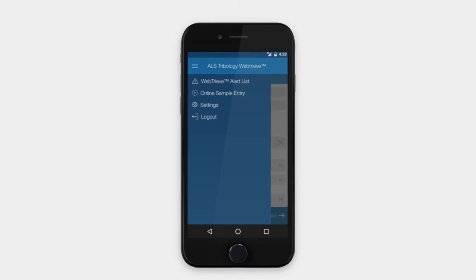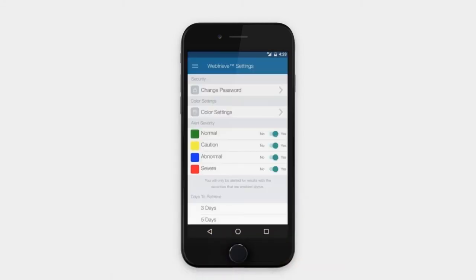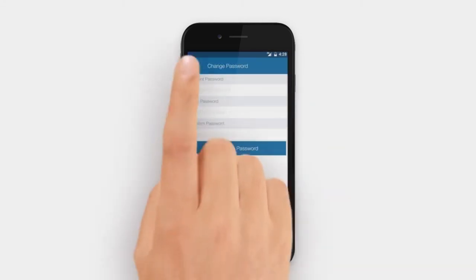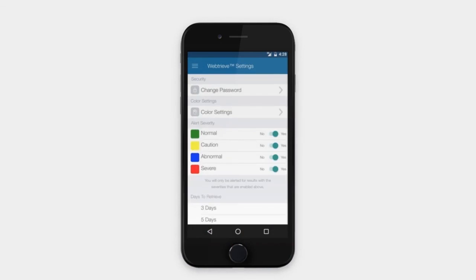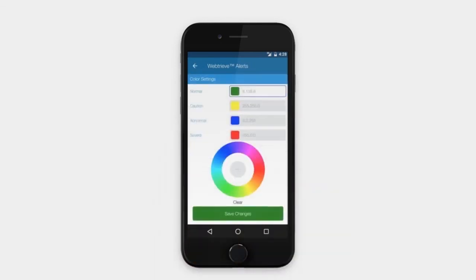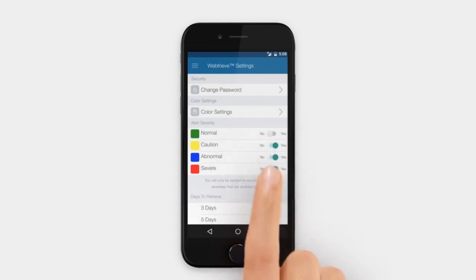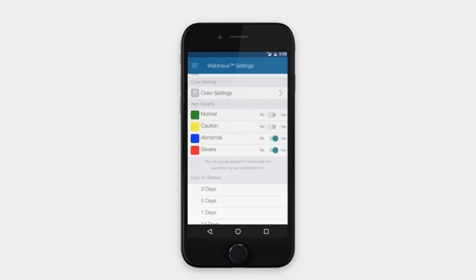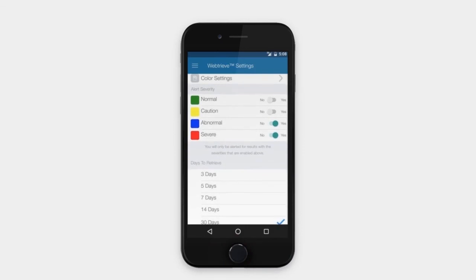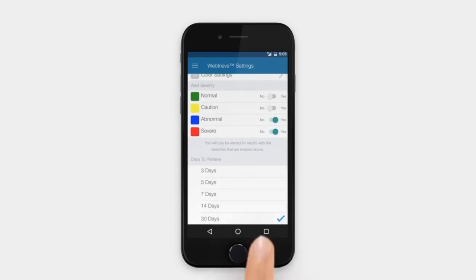And finally, you can make changes and customize the app with your own preferences. In settings, you can update your password, customize your color settings, select which sample conditions you wish to receive on your sample alert screen, and how many days of data you wish to retain on the mobile app.